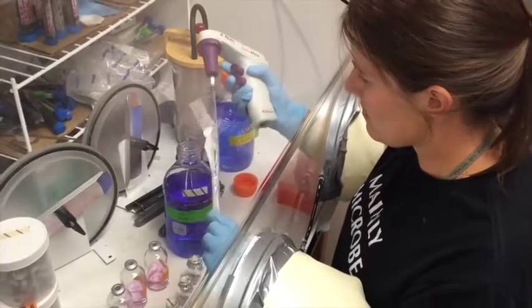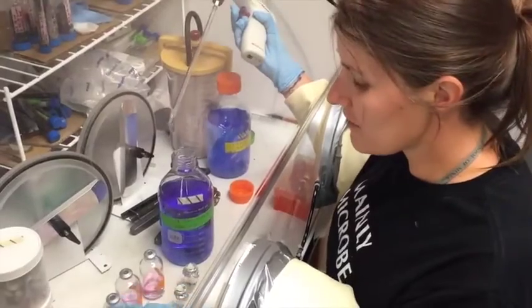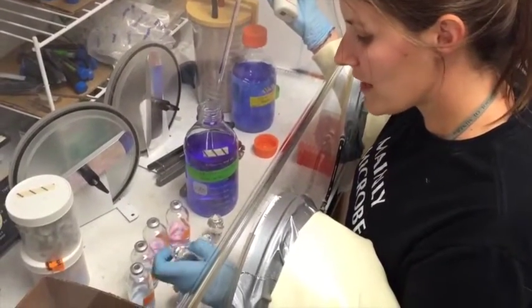Scientists mix microbe food, water, and the sample to see if anything grows in it. They're very careful not to get any other microbes in the mix.